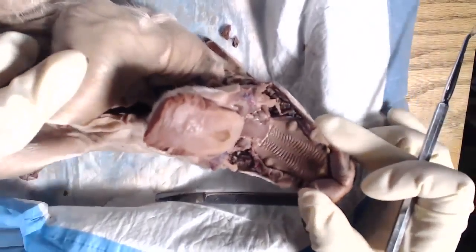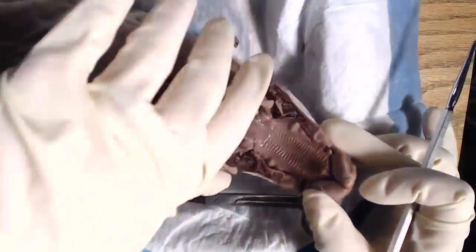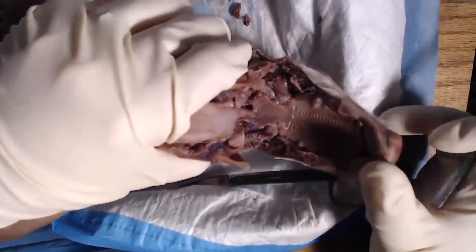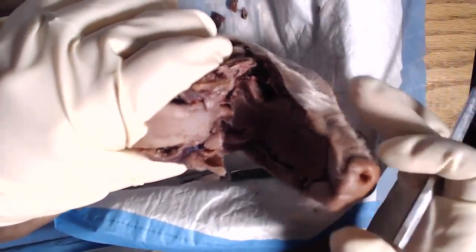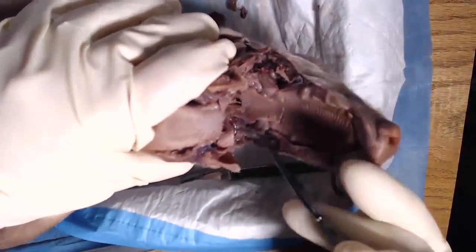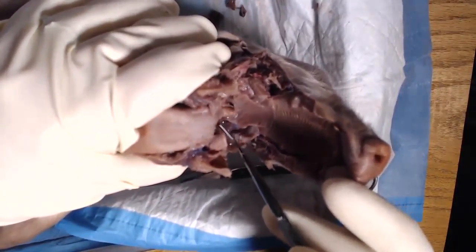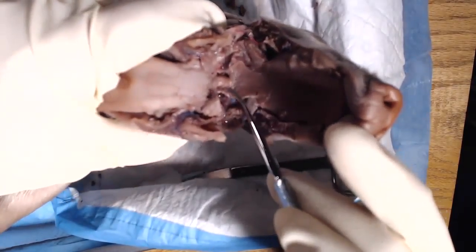All right, so next we're going to open up the mouth as wide as we can and look in the very back of it. And you should see this prominent flap here, this piece of tissue. That is the epiglottis.